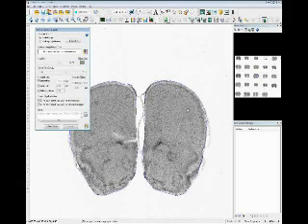And now hopefully you can see the blue line that has gone all the way around each of these hemisections here. So now that we've approved, I'm satisfied with how it looks in this preview mode. You can see that only one section is outlined here at a time. So we haven't gone and done the detection for all objects.